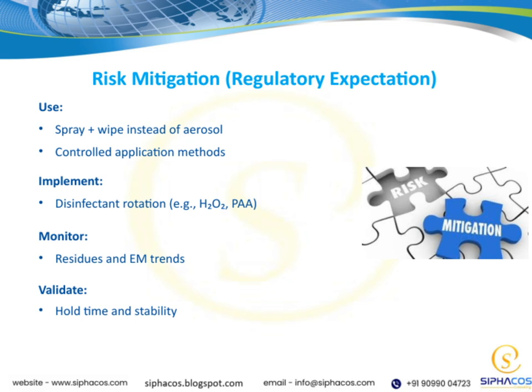Finally, validation plays a key role. We must validate hold times and stability to ensure disinfectants remain effective throughout their intended use. This comprehensive approach, covering use, implementation, monitoring, and validation, supports both compliance and safety, aligning with our overall goal of maintaining a secure and effective environment.